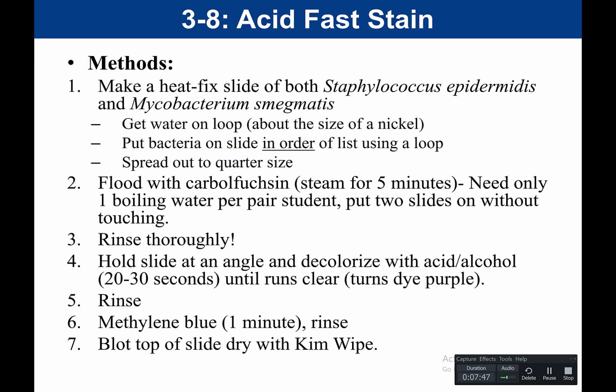You should, however, understand that we have to steam with carbolfuchsin. And the reason that we have to steam with carbolfuchsin is we need that carbolfuchsin to be able to penetrate that waxy mycolic acid. And so if we don't steam with carbolfuchsin, acid-fast positive bacteria will not stain because you need that steam to get the dye in. So you should know that we use carbolfuchsin with steam.